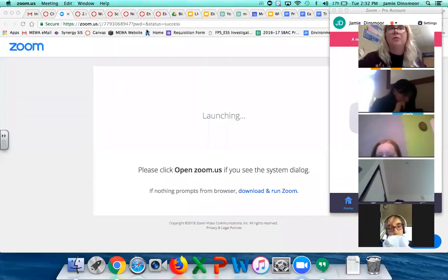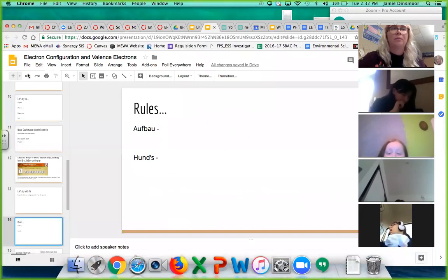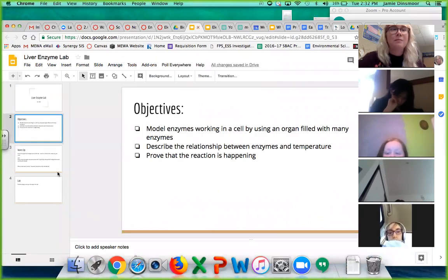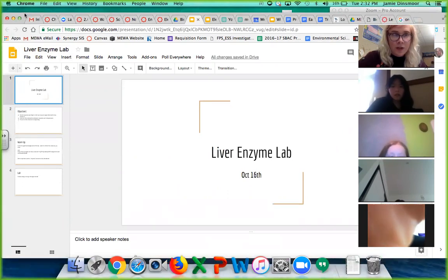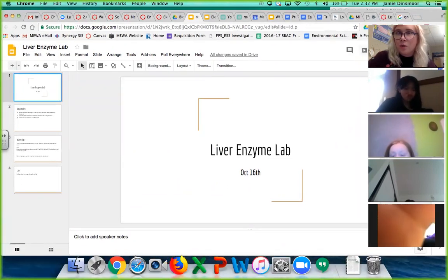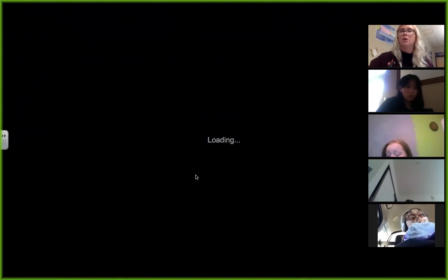All right, liver enzyme lab. So what's happening right now is we're going to go through this PowerPoint that I made, and we're going to look at some live action enzyme stuff. So we are going to get started here. Liver enzyme lab, taking forever to load.